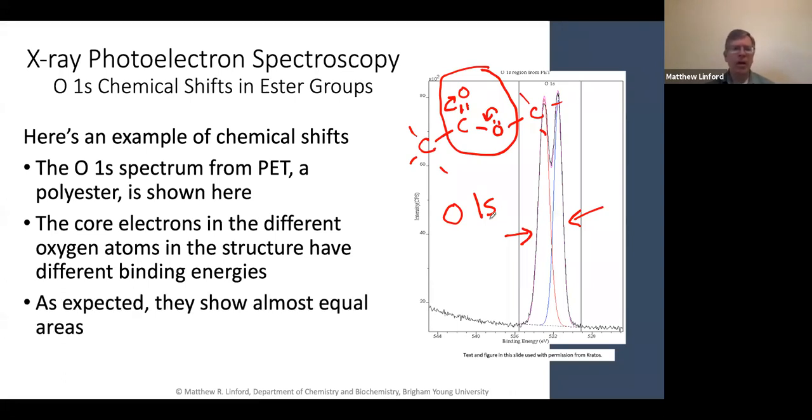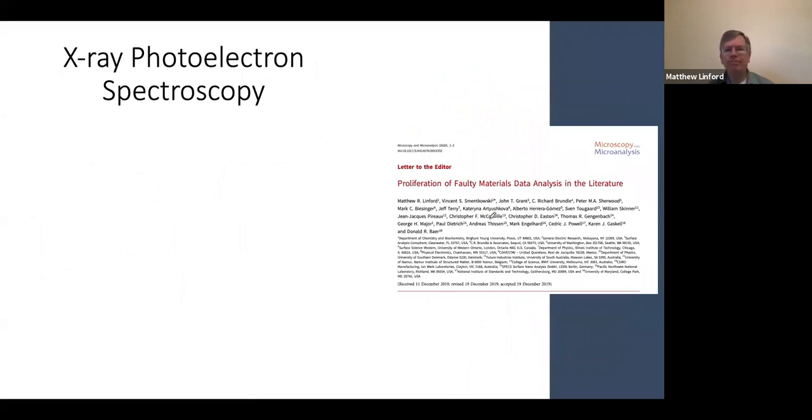Okay, so this brings us now to a rather important topic, and that is I want to give you a sense of what's going on in the field right now. Is XPS becoming more important? Yes, very much more important. But there's been a problem associated with that, and that is that, as I think I mentioned, about 30 years ago, XPS was done by a bunch of really talented people, and it was only done by a few people. And so they really specialized on the technique, and they really got it right.